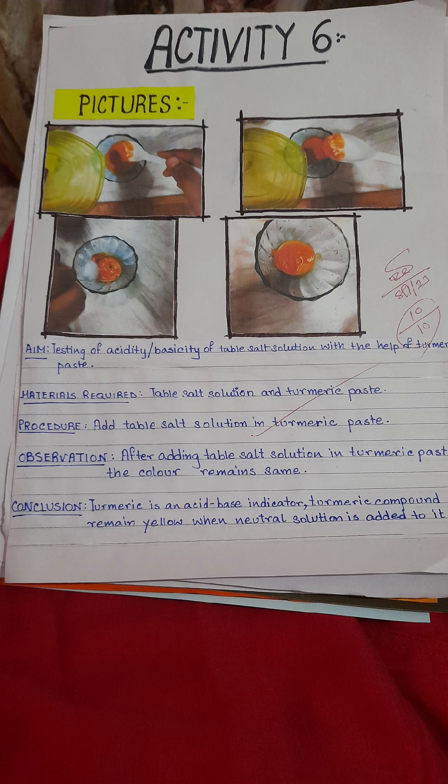This is activity six. We will see that when we mix salt solution with turmeric paste, there is also no change in color.